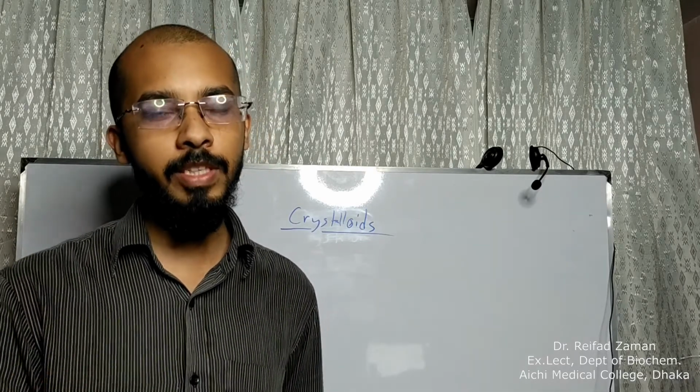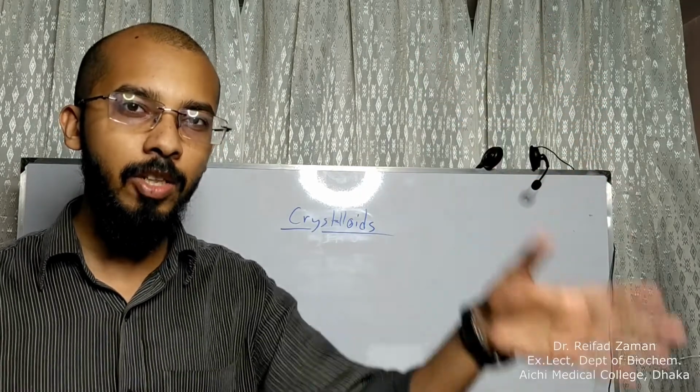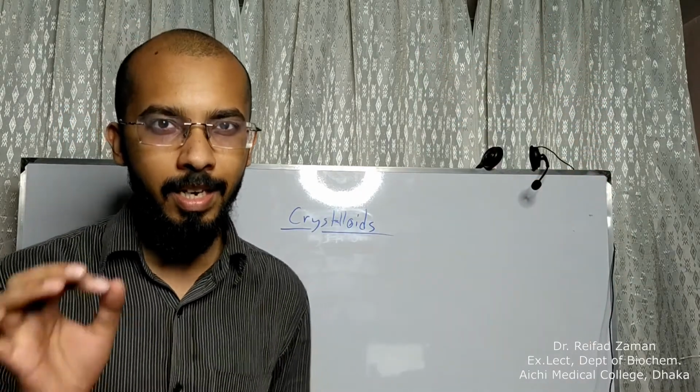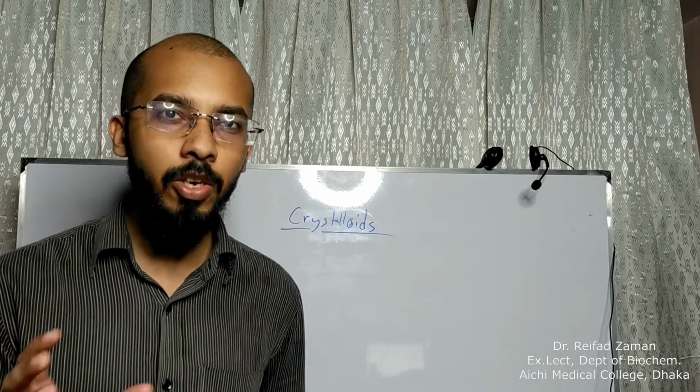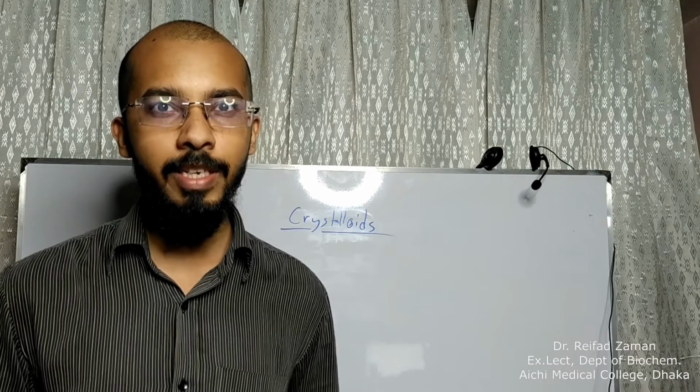For example, you can think of sugar solution and salt solution. They form a single homogeneous state. And in these cases, the solid molecules in the size অনেক ছোট থাকে. So let's make some crystalloids.